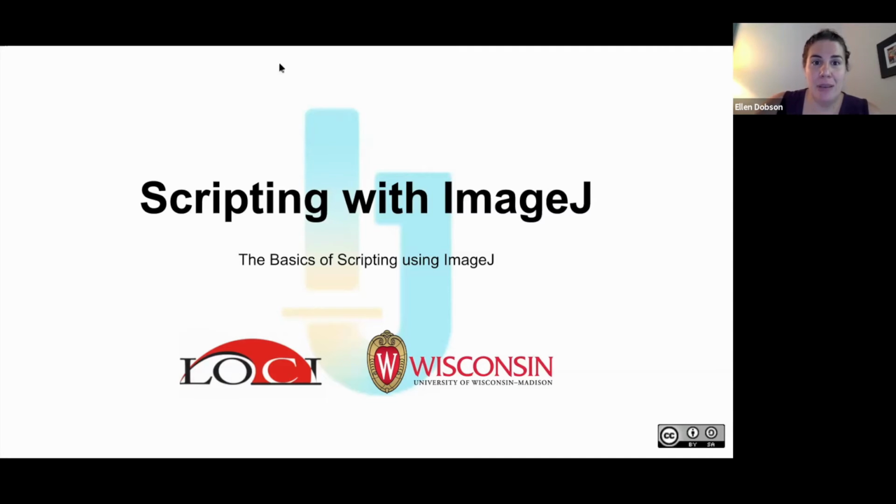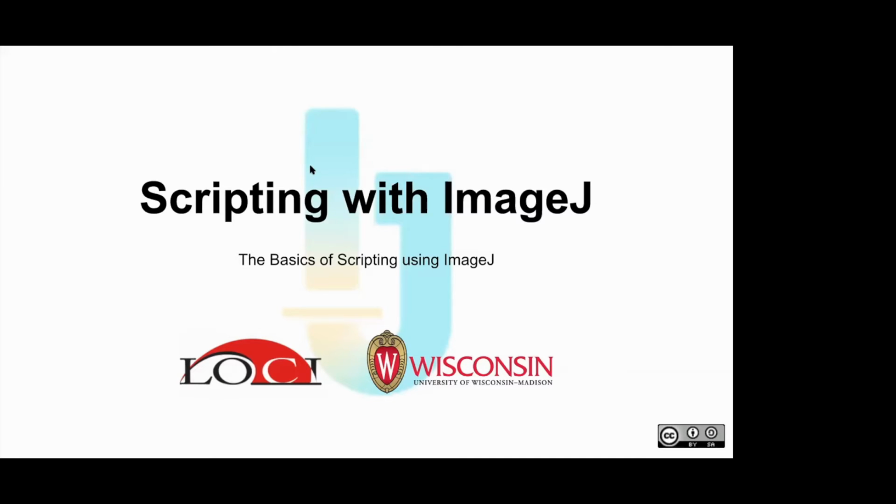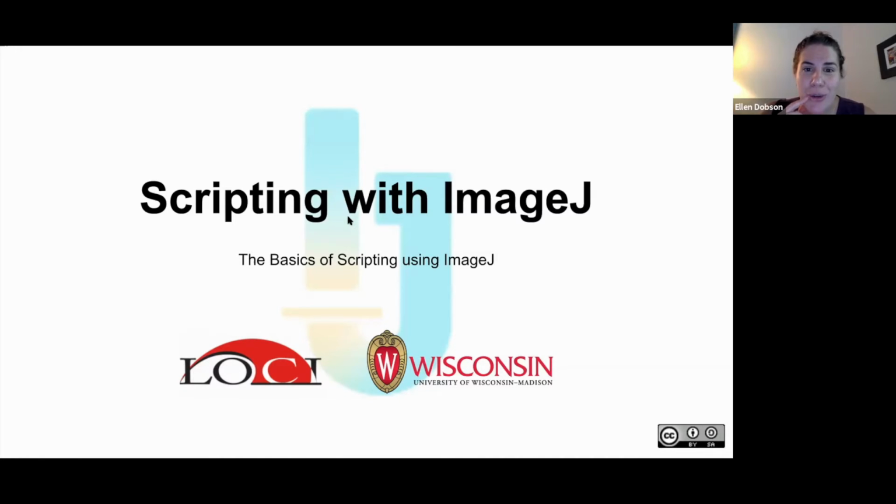Okay. Are there any other questions? There's one more that I think we might have missed. It says, in most cases the nucleus, so DAPI, is co-incubated with many antibodies. Does the area of the DAPI need to be removed first when only the antibody's intensity is measured?